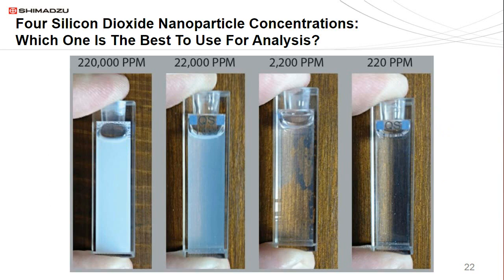So we'll now turn from carbon nanotubes to other types of nanomaterials which can be used in either a suspension, they can be used in creams such as sunscreens, and they can actually be impregnated into surfaces such as clothing where they might form an odor-reducing component. So UV visible near-infrared spectroscopy is a very useful tool in analyzing nanomaterials no matter where they're embedded, be it solid, cream, solution. The first question to ask is, what concentration is amenable to analysis?